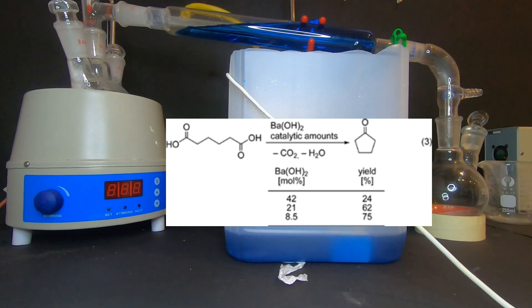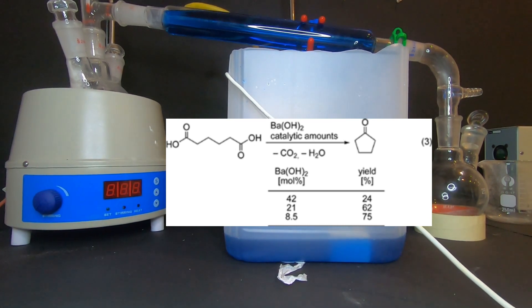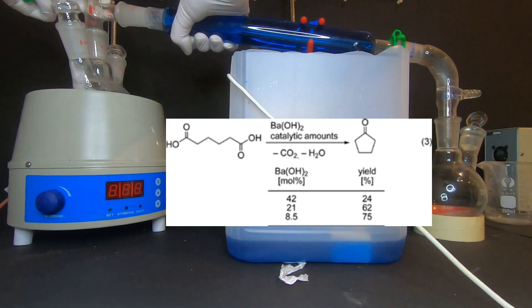Barium hydroxide catalyzes the decarboxylation and cyclization of adipic acid to produce cyclopentanone.